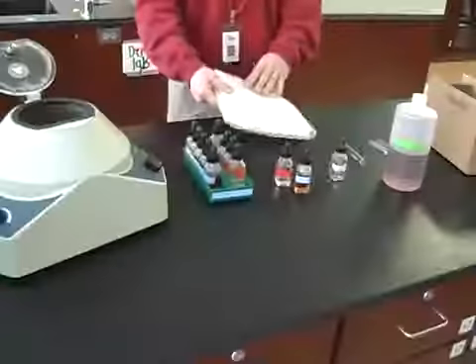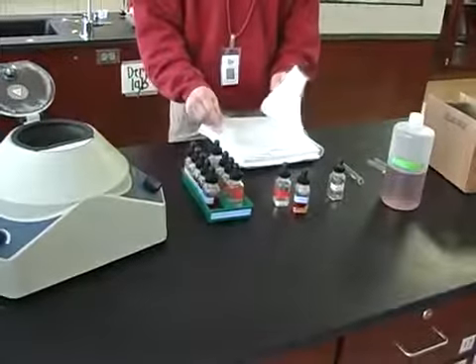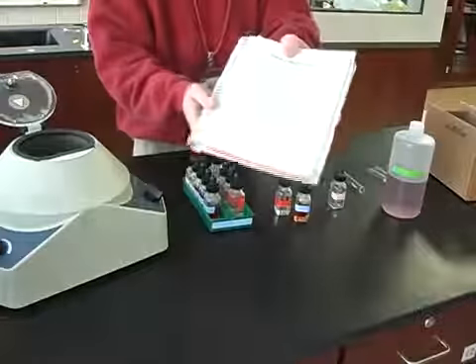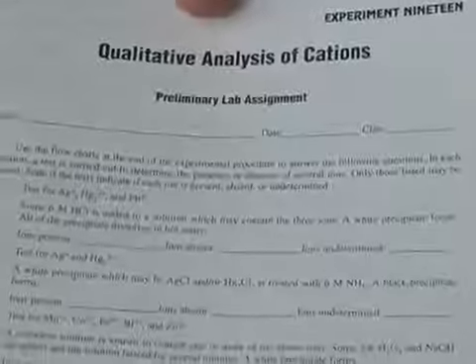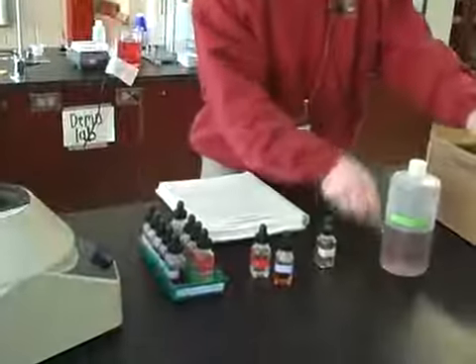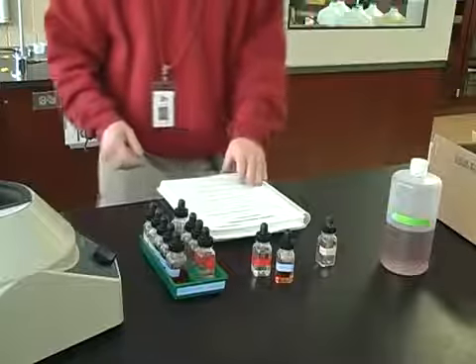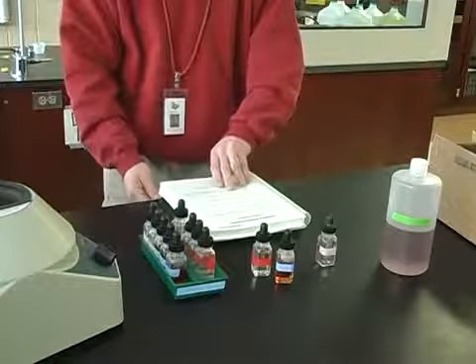Okay, if you go back to the very beginning of the lab, there's a number of questions. It's called the preliminary lab assignment. It looks kind of like this. And there's a number of questions to answer at the very beginning about the qualitative analysis scheme. We're going to go through a few of those right now, and I think we'll take 10 minutes and see how far we get. And we won't answer every question, but we'll get a good idea of how the scheme works before the lab actually starts.